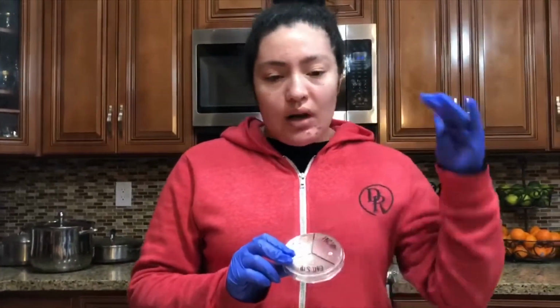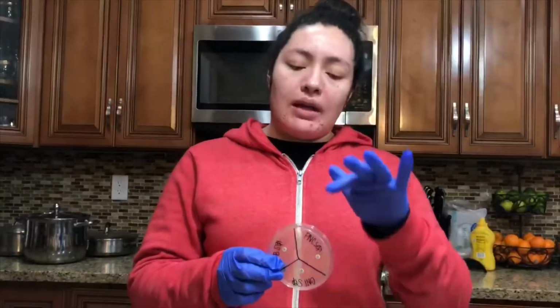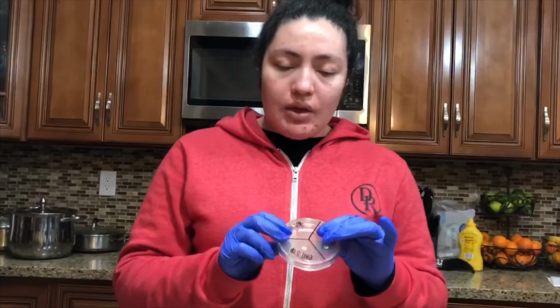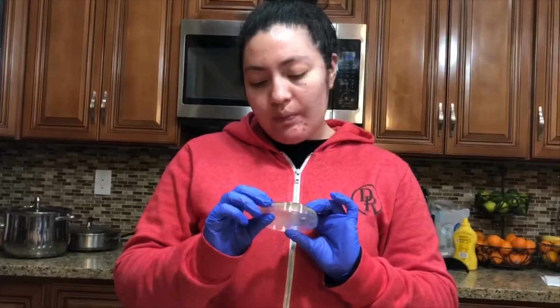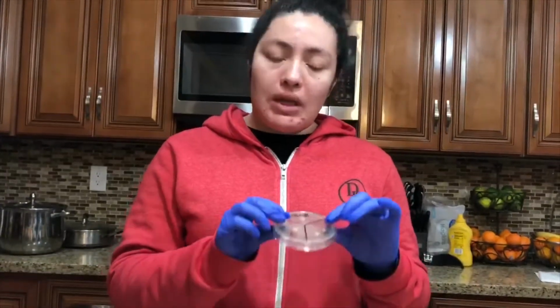So refresher on this, what I did a day ago was basically got the S. epidermidis microbe and evenly distributed it on the agar plate, and then placed each antibiotic, the penicillin, gentamicin, and the novobiocin in its recommended area, and I wanted to monitor any zone of inhibition. So as you can see, out of all 3, the one that actually had a larger zone of inhibition was the novobiocin. It was 12 millimeters.